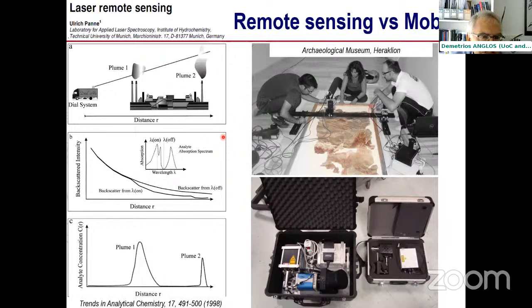implemented. On the left-hand side of the slide, basically we see a typical example of a ground-based unit loaded with lasers and spectrometers, and the essential part of it is a laser beam that is directed over to the sky and meets several changes or disturbances of the atmosphere, for example, smoke and other pollutants.